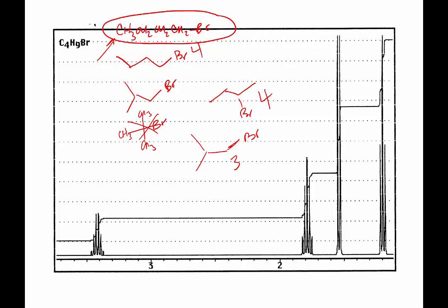Triplet. You can be more aggressive. So that one's going to be a triplet. How about this CH2? Singlet, doublet, triplet, or multiplet? Multiplet.